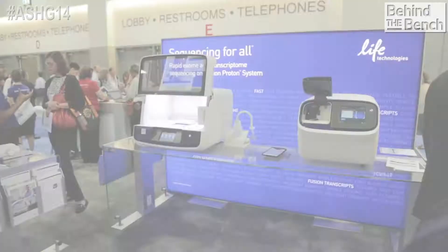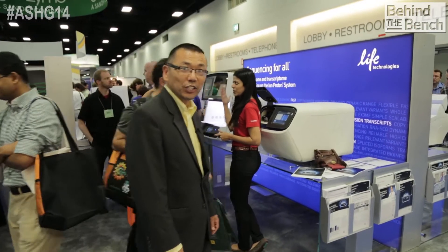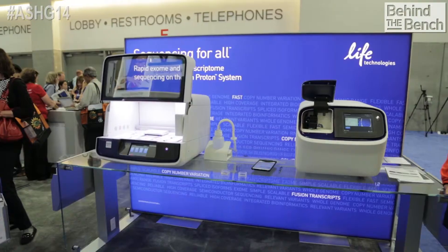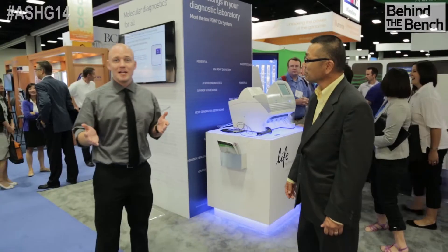First up is next generation sequencing. Here we have the Ion Torrent Proton — there's a lot of interest in AmpliSeq transcriptome on the P1 chip. Next to it is the Ion Chef for automated template preparation. There's a lot of interest in the Ion Torrent platform for NGS, and we're highlighting a lot of great products and applications here.